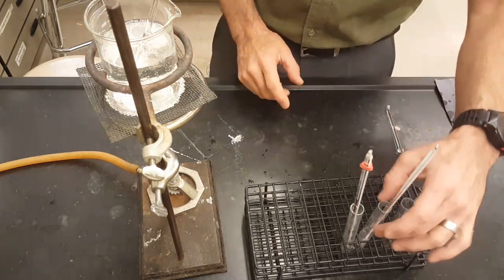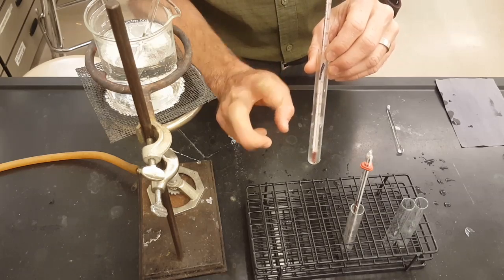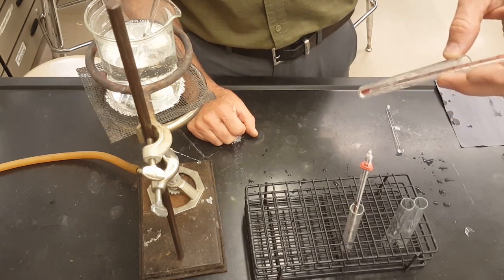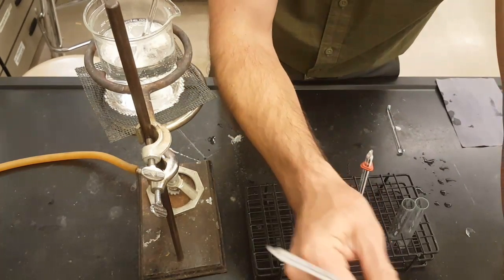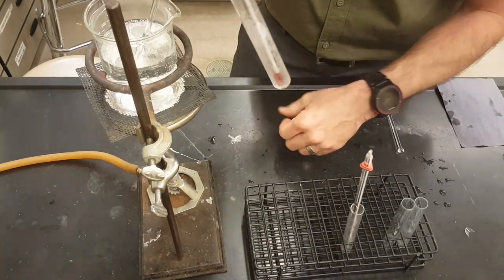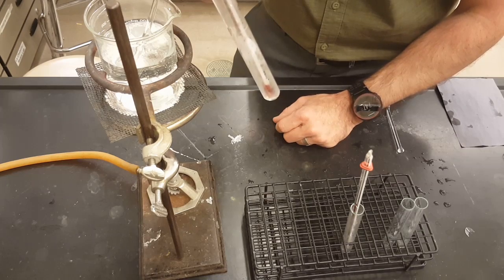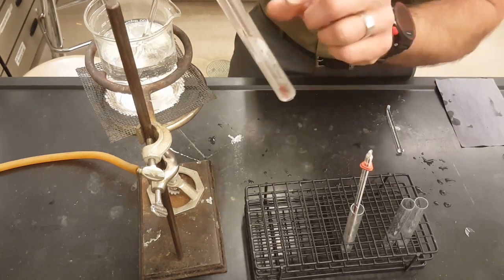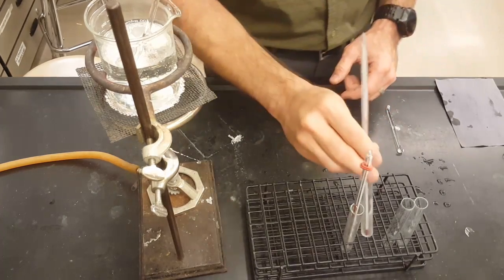The only problem here is that test tube number 1, which is your 2 grams of potassium nitrate test tube, is going to take a really long time to crystallize. So if you're running out of time, run a little cold water and see if you can get the potassium nitrate to hit that saturation temperature. It ends up being close to room temperature. So you really have to cool this down. Don't be afraid to use tap water.